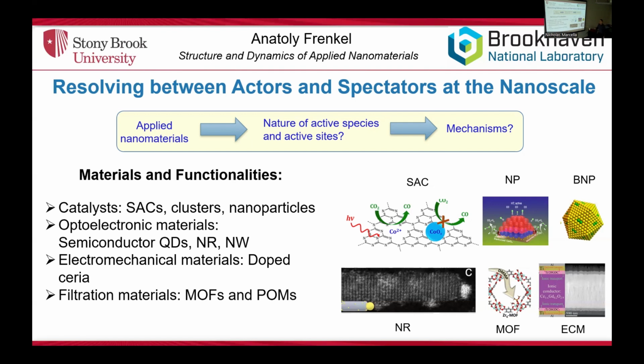So in the case of single atoms, one would think, well, how many knobs can there be if there's just one atom? And if it does catalysis, this is it. But that was the naive thought, because it was soon understood that it's not that simple, because the catalyst may be coexisting with others located in different sites, some of them more active than others, and the descriptors could range from some strain in the local environment, bonding distances, and so on.